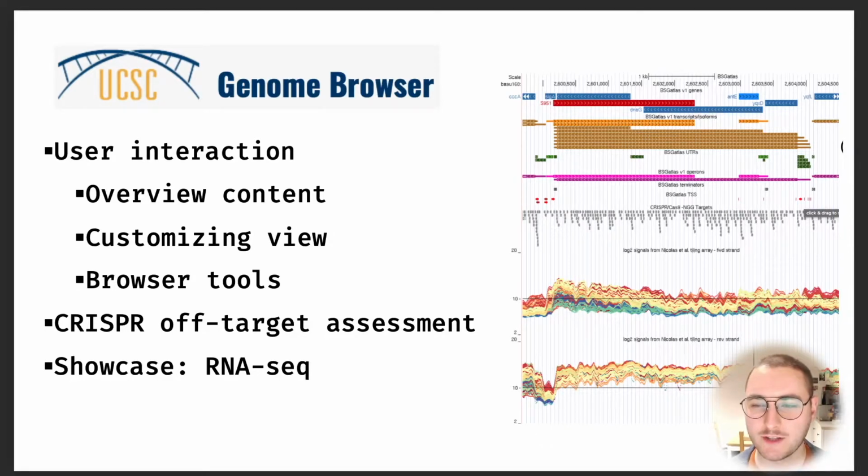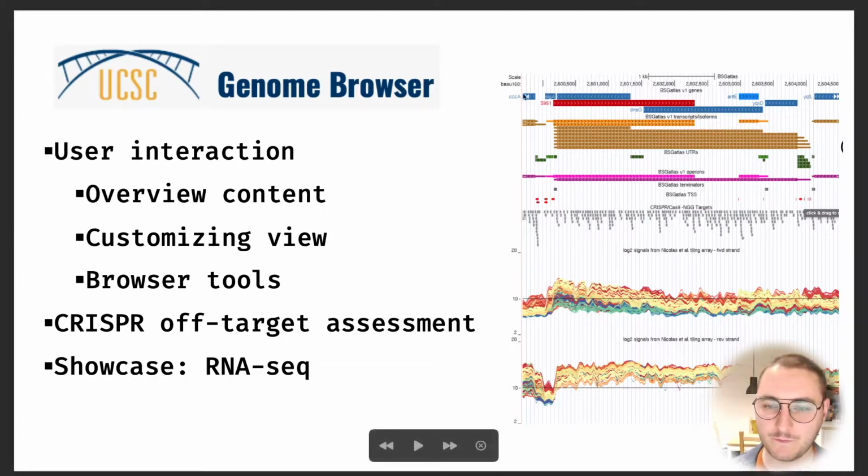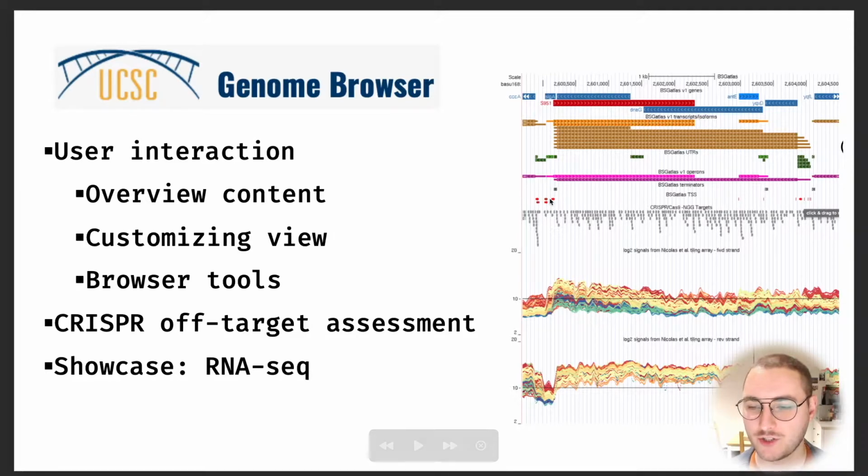The Genome browser has, at first glance, a similar structure to the browser that we showed on the website. If we start from top to bottom, we have on the top gene annotations with blue indicating coding genes. Underneath we have isoform annotations, operons, untranslated regions, and transcription start and termination sites. However, even more information is shown underneath.